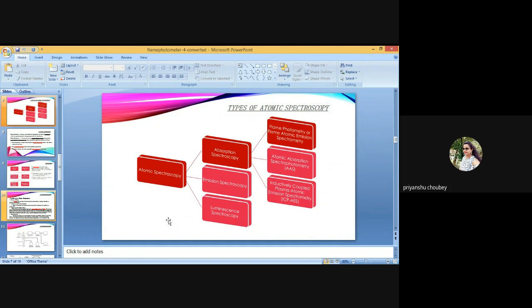However, multi-element working standard solutions, or secondary standards, should be made in such a way that they contain the maximum number of elements compatible with stability considerations and match with the sample solution in kind and strength of acids.